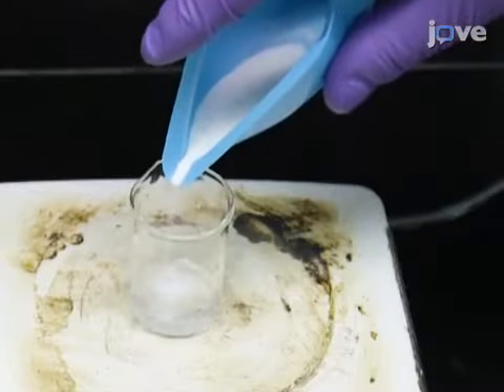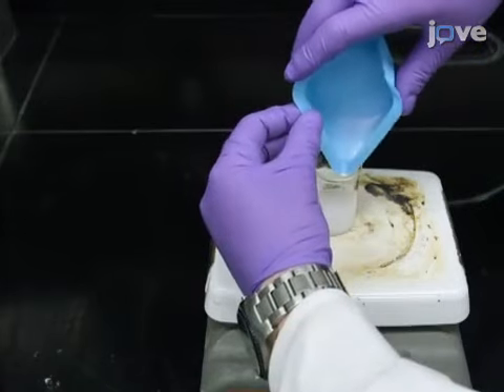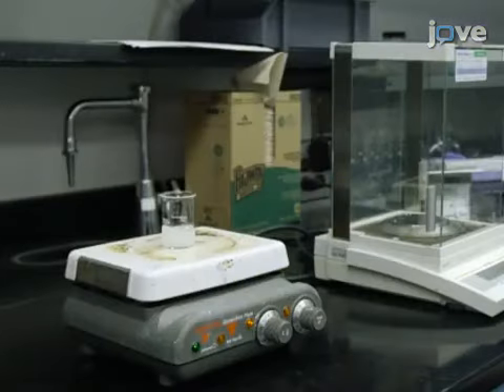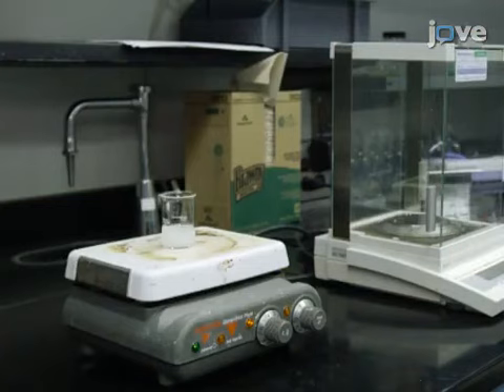Slowly add 2.778 grams of L-Arginine under magnetic stirring. Once the L-Arginine is completely dissolved, heat the solution at 50 degrees Celsius for 72 hours.